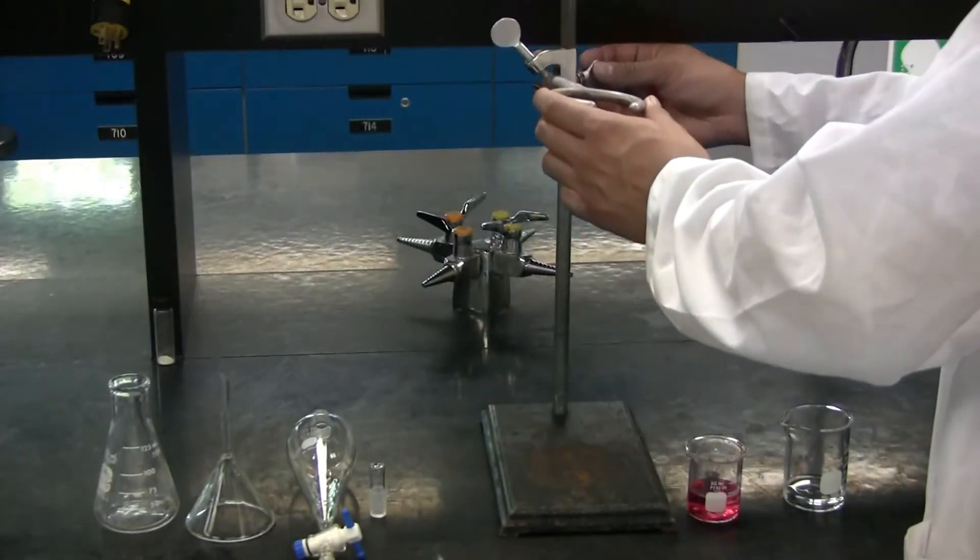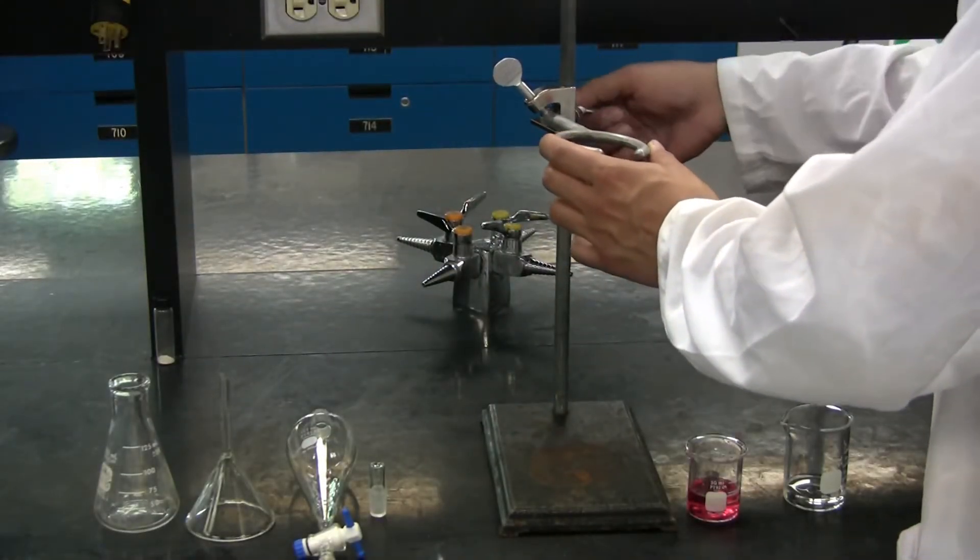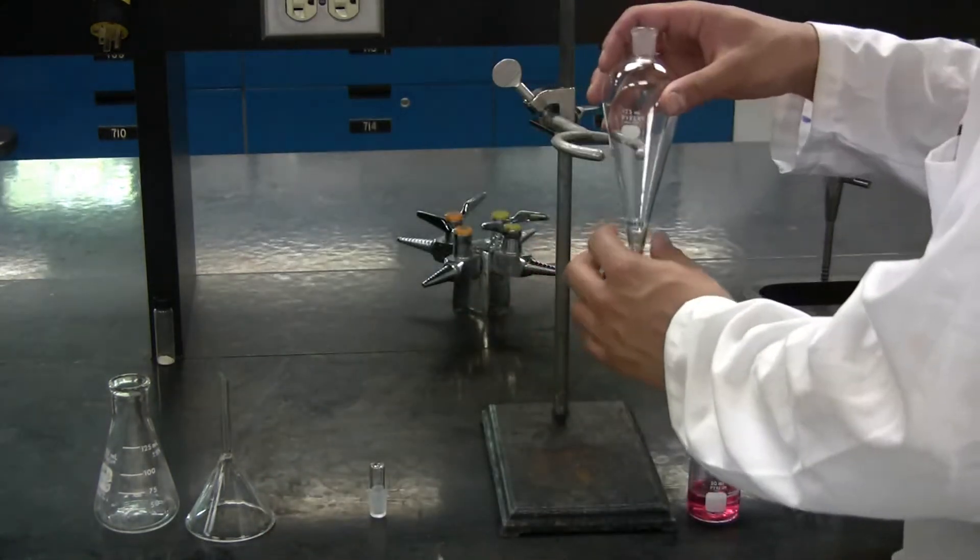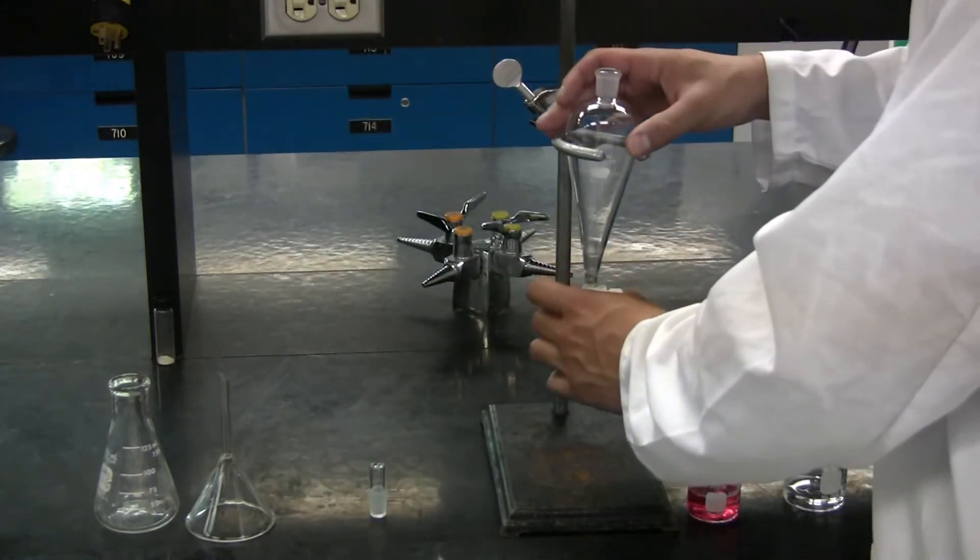Start by placing the ring clamp onto the retort stand. Next, take your separatory funnel and place it in.